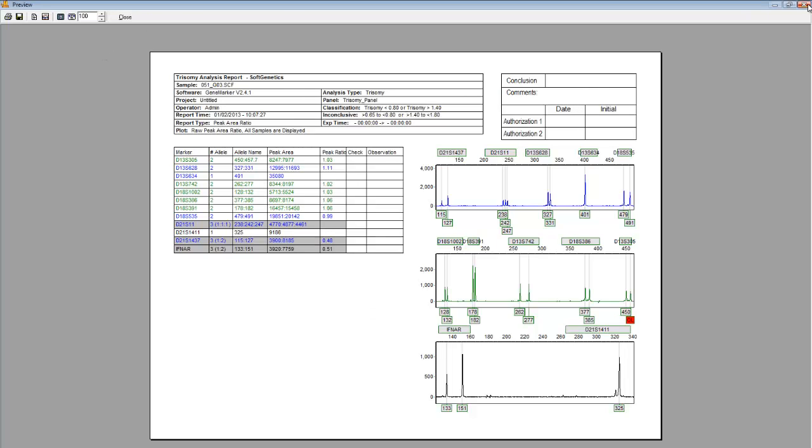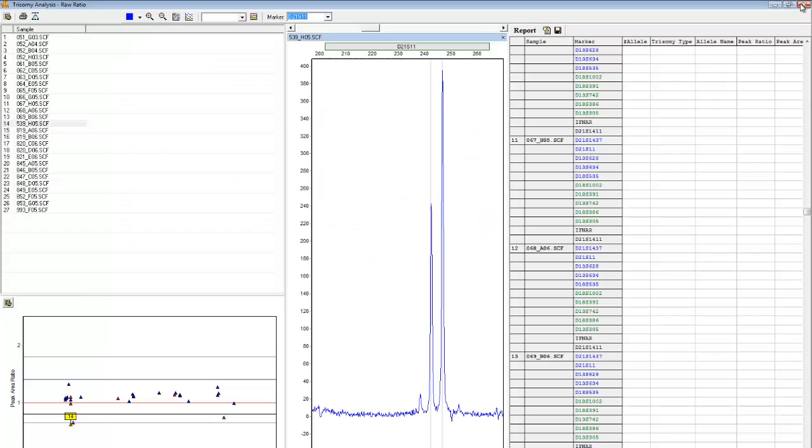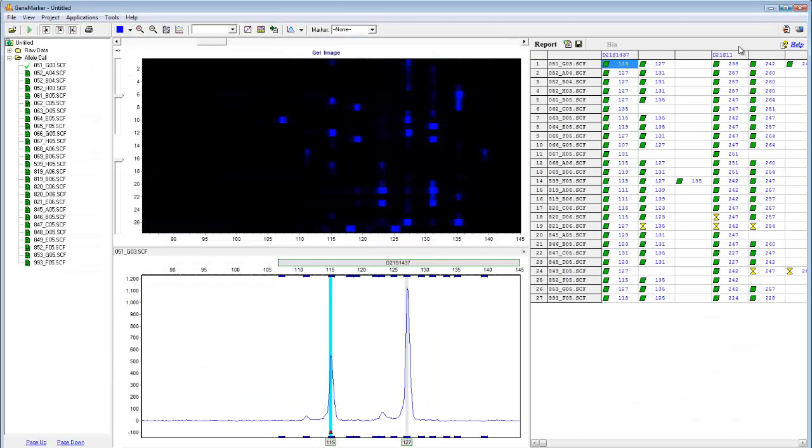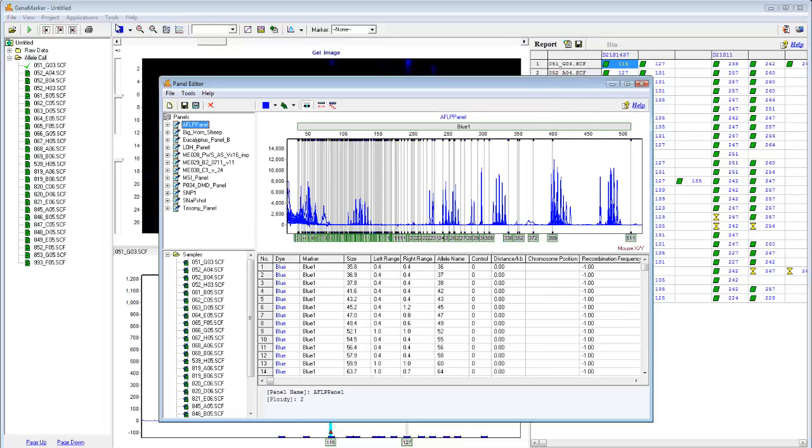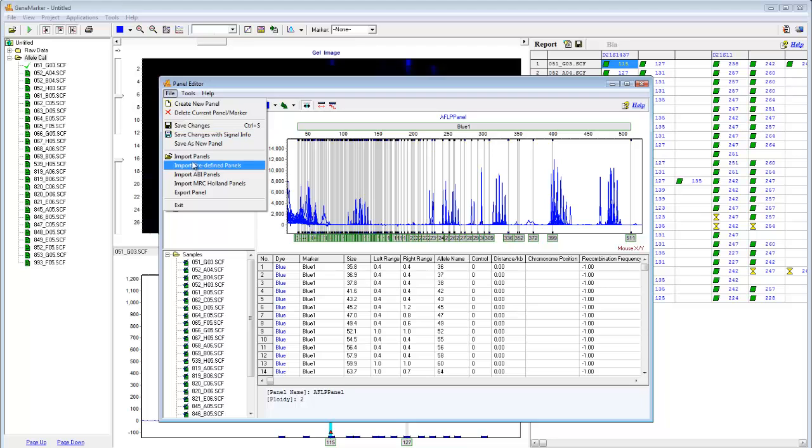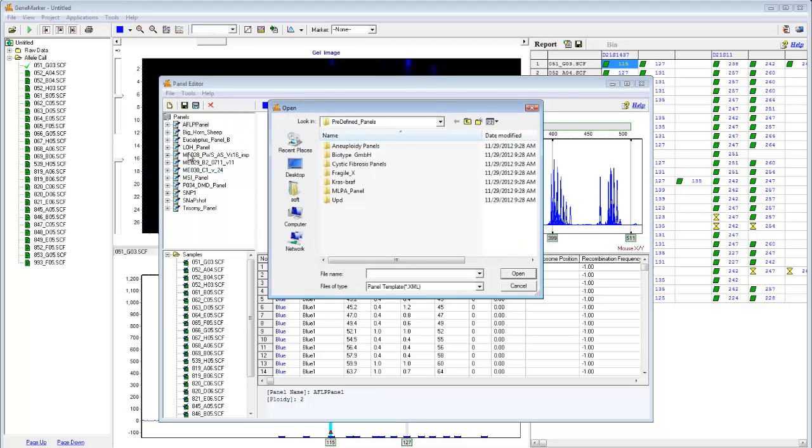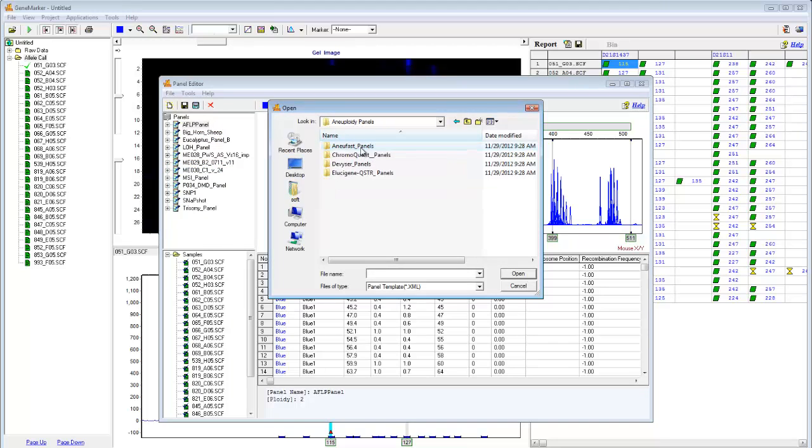One last thing I'd like to show you is the panel editor, which can be used to import many trisomy panels installed with GeneMarker. To access the panel editor, simply click Tools Panel Editor. Click File, Import Predefined Panels, and then select Aneuploidy Panels.